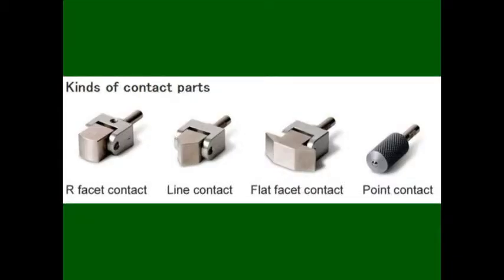This instrument can also measure with a variety of contact parts, including a round facet contact, a line contact, a flat facet contact, and a point contact. You can also request custom contact parts to be produced and used for your measurements.